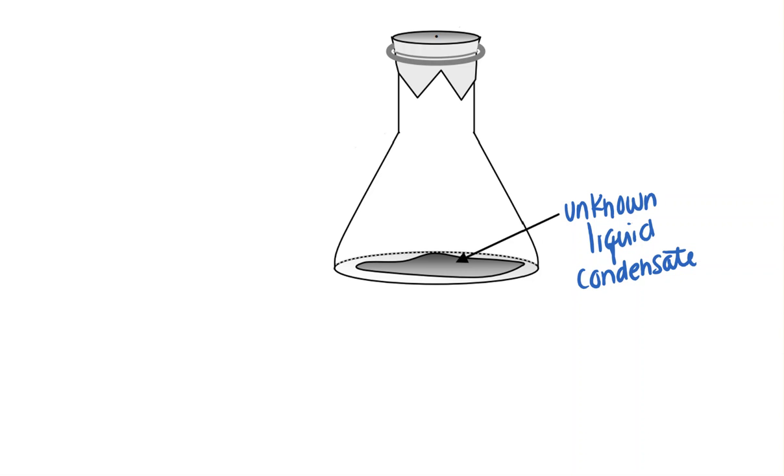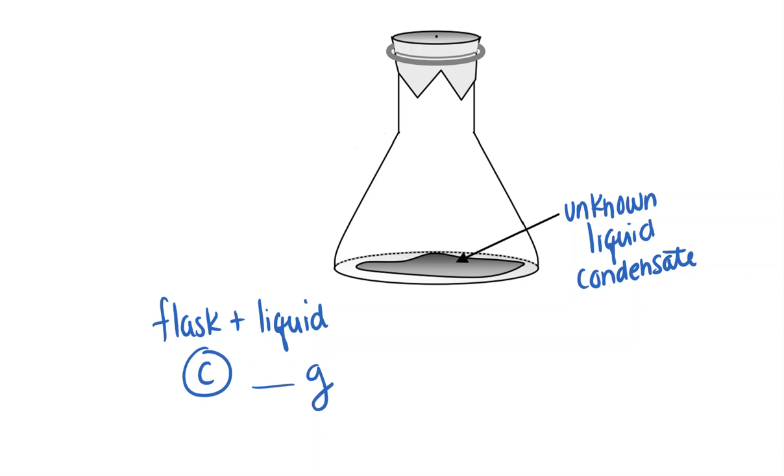And then we'll weigh the flask plus the liquid, and that will give us our data C, which your instructor will give you as a number in grams.